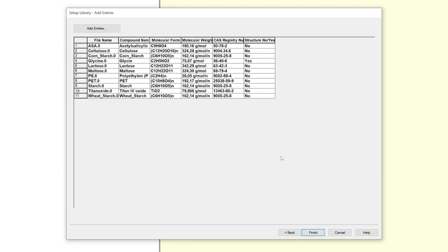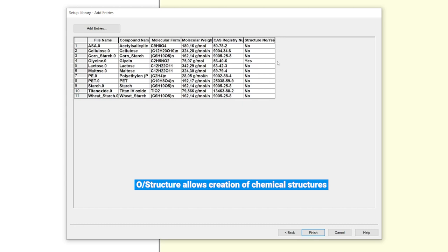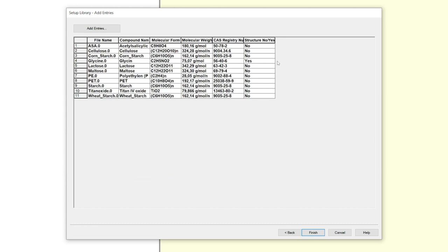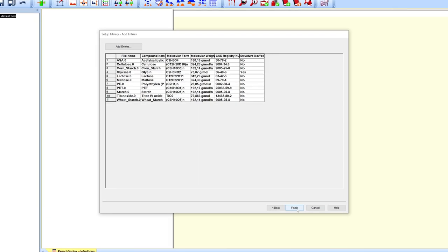If your spectrum contains a structure block, it will be marked in the structure row. To connect the structure to a spectrum, you need the OPUS structure add-on. At last, press finish. The library is now created.